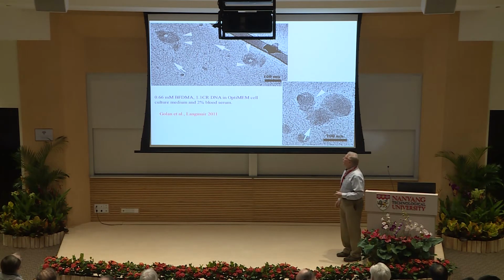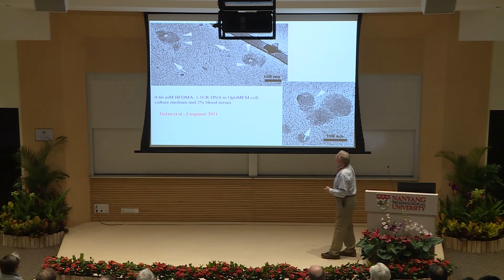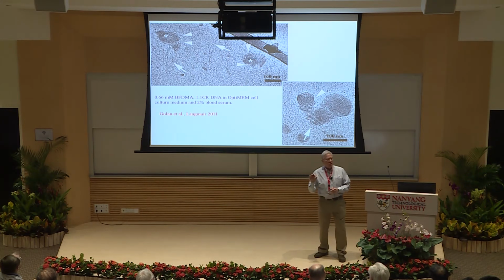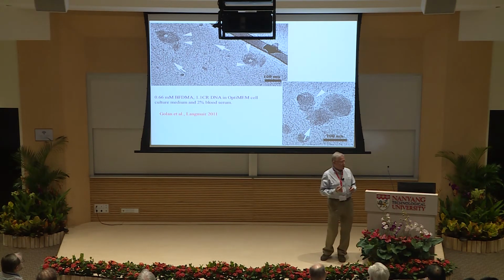By the way, I looked again at those pictures yesterday, and we see on the DNA quite a bit of very dark dots. Before that, I tended to interpret those as ends of the chain looking up towards us.